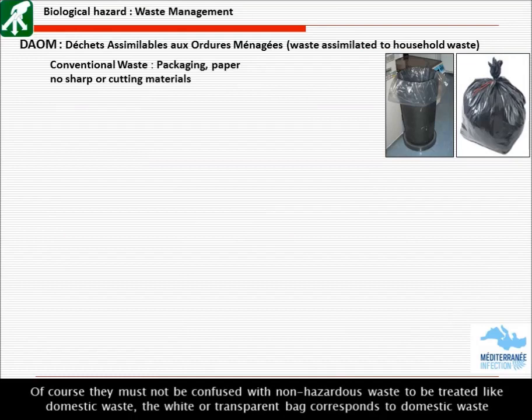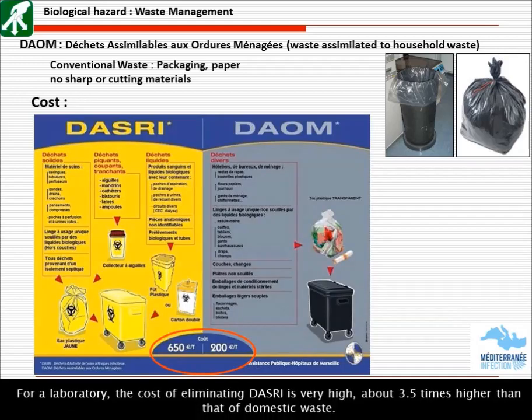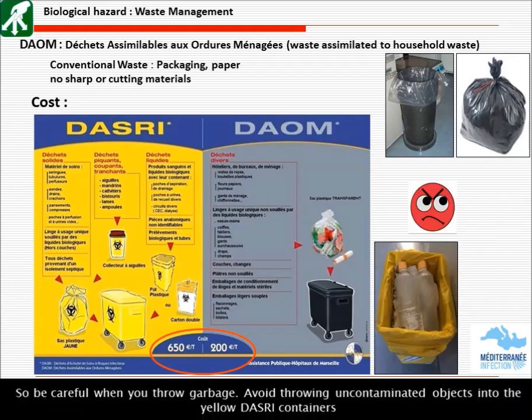The white or transparent bag corresponds to domestic waste. For a laboratory, the cost of eliminating DASRI is very high, about 3.5 times higher than that of domestic waste. So be careful when you throw garbage. Avoid throwing uncontaminated objects into the yellow DASRI containers.